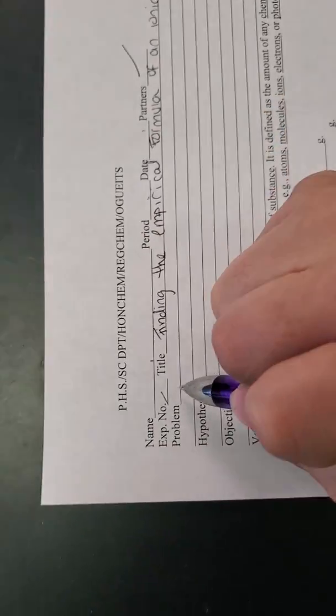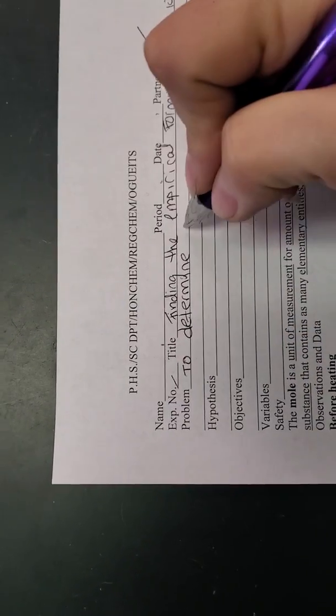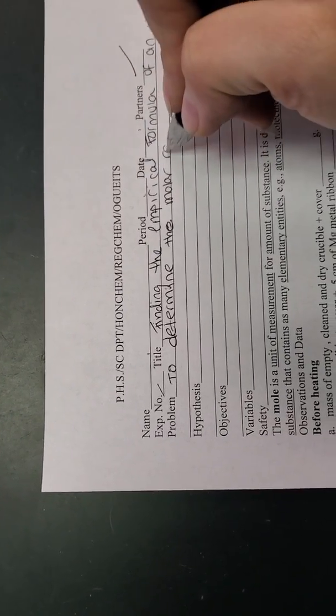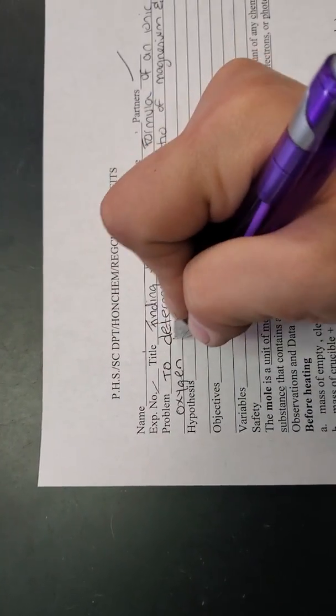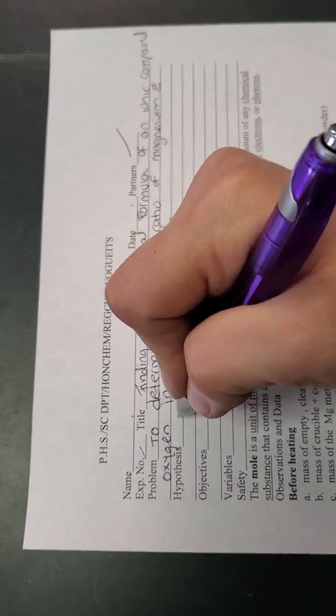All right, the problem in this experiment was to determine the molar ratio of magnesium and oxygen in an ionic compound. Okay. The hypothesis. Well, what we did was we burned a piece of magnesium metal.